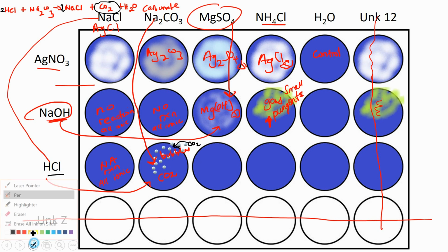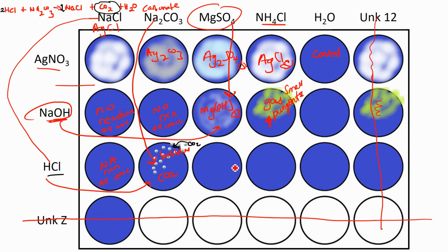And then for the next well, let's see, did we finish this well? Yeah, for the next well, I want you to predict what will be in there. Of course, here there's no reaction, and this is just a control. Obviously here you get magnesium chloride, which most likely is soluble, so most likely here there's no observable reaction. I'll confirm it with your charts.